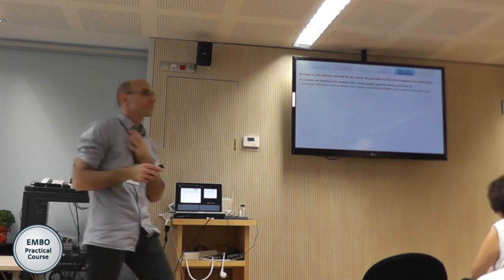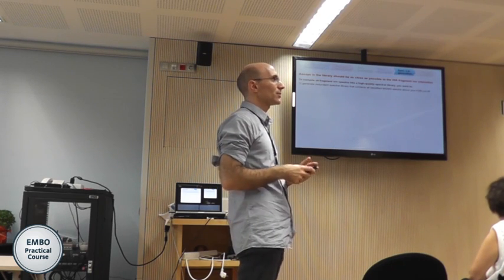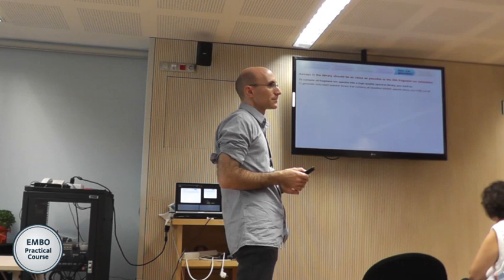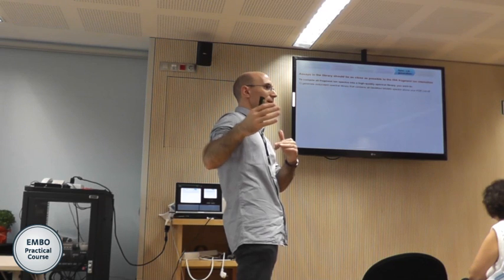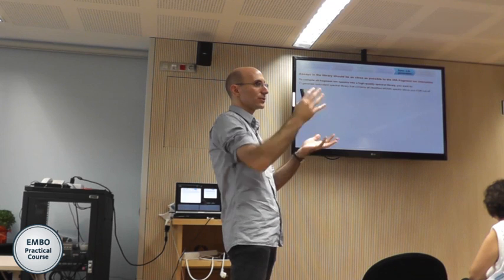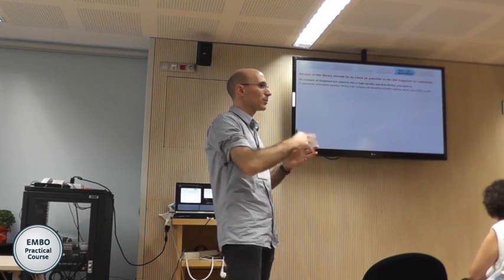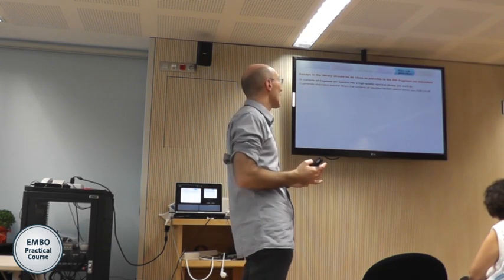Do you go back at all to the library and do that again? Because in principle, as soon as you add more shotgun data, you have the same problem when adding to a library. Yeah, the false discoveries are going to accumulate faster. If you want to increase your library size, you anyway need to go through the entire pipeline. Here I'm also going to speak about the library generation, the consensus generation, the IRT merging and IRT splitting. So each time you want to extend your library, you might need to reprocess everything, I guess.